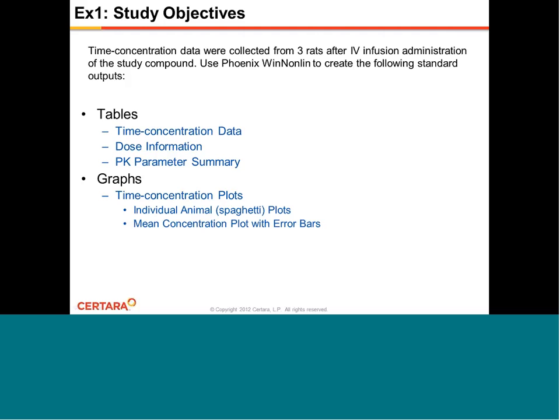They include tables, which are the time concentration data, dose information, and PK parameter summary tables, as well as some graphs, which include time concentration plots of the type individual animal spaghetti plots, as well as a mean concentration plot with error bars.